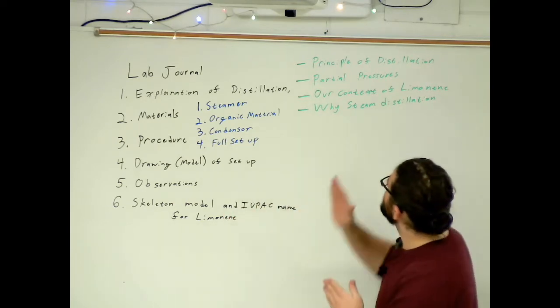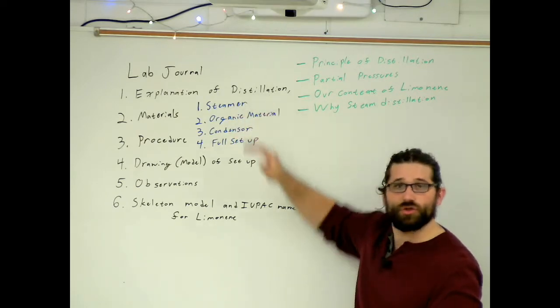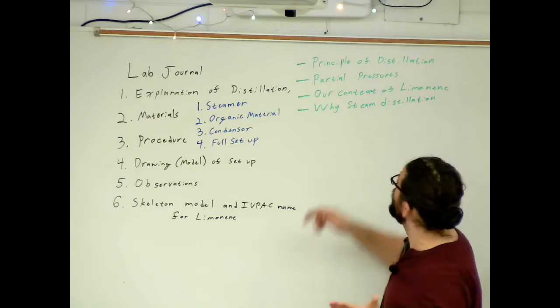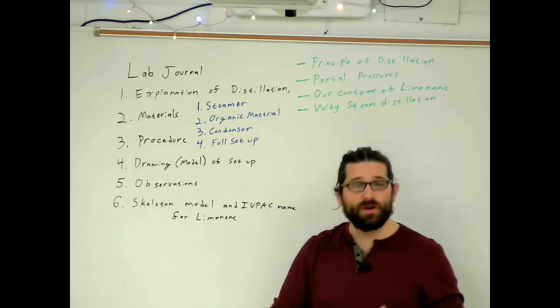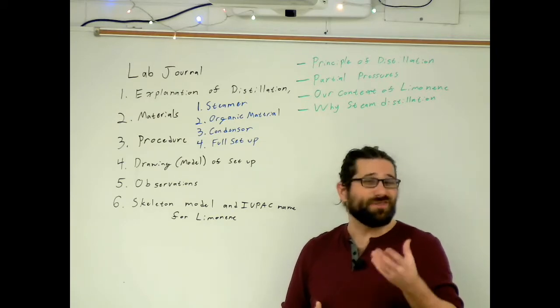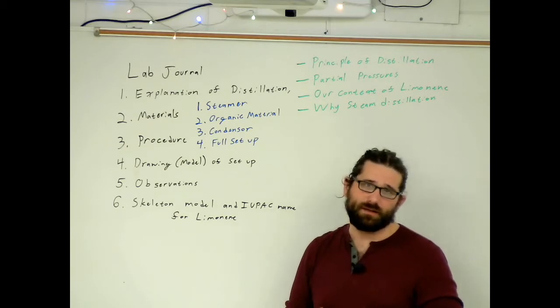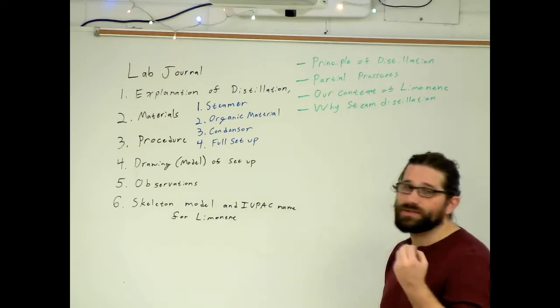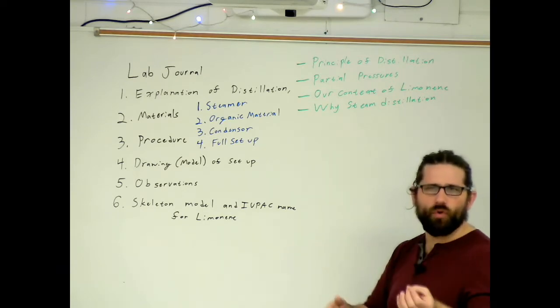So when you give an explanation of distillation, you'll be talking specifically about the principle of distillation. This is a laboratory technique that's used to separate various compounds, and it has very specific applications, and it's a very powerful lab technique. So you'll be talking about how does that work? How does distillation separate the limonene from the orange peel?